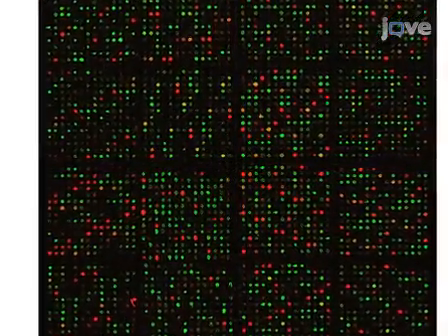Ultimately, results can be obtained that show the genome-wide expression of microRNAs through analysis of the slide for hybridization intensities of the individual microRNA probes.